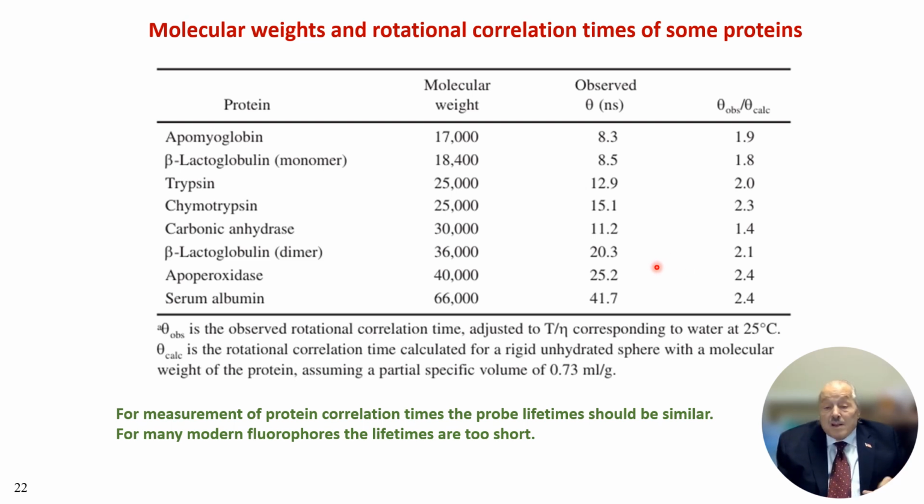So it's hard to measure higher molecular weight species from the correlation times in the anisotropy decays, because basically the probes stop emitting before much rotation has occurred.